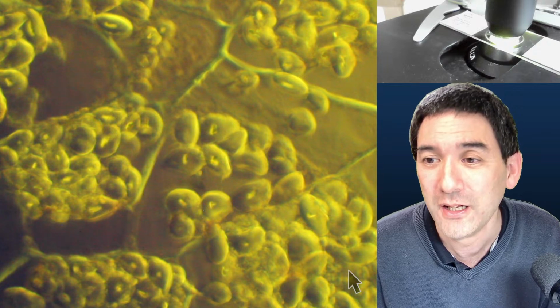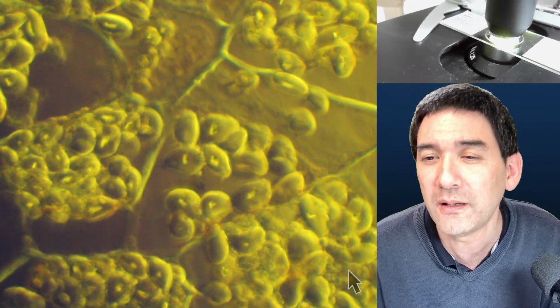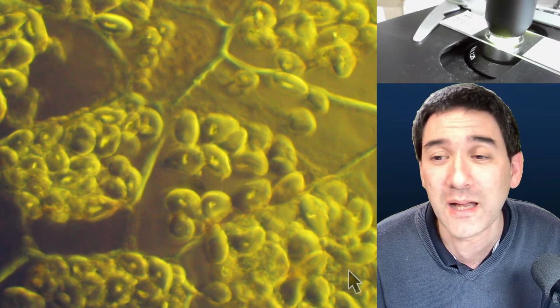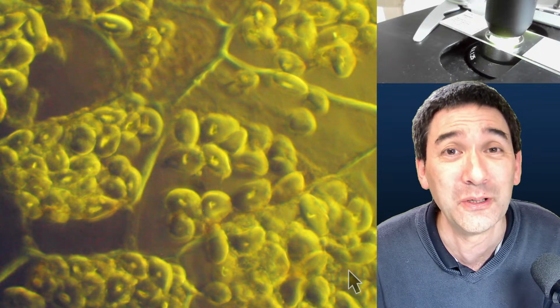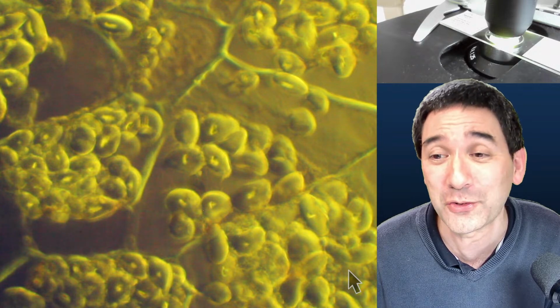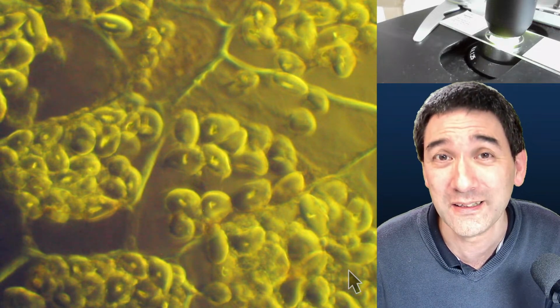Yeah. So, last comment here. You said at the outset that you have received emails with questions. I found a strange microbe. What email should I direct my query to? My suggestion would be, I sometimes also have problems identifying microbes because many different microbes look quite similar under the microscope. So sometimes you need several pictures. I also recommend that you get yourself, if you're interested in this, an identification book. Okay, and then this might also help.